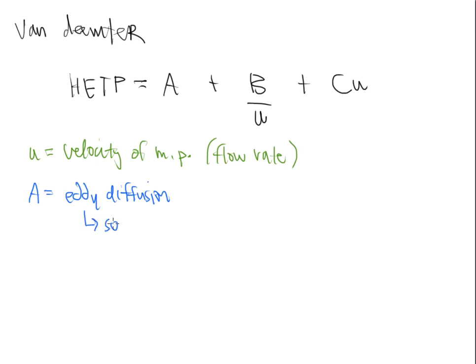It's basically the solvent takes different flow paths through the stationary phase. Right? That's what eddy diffusion is all about. We've actually talked about eddy diffusion already. We just didn't label it or title it as eddy diffusion at that time. We just said there's multiple flow paths involved.